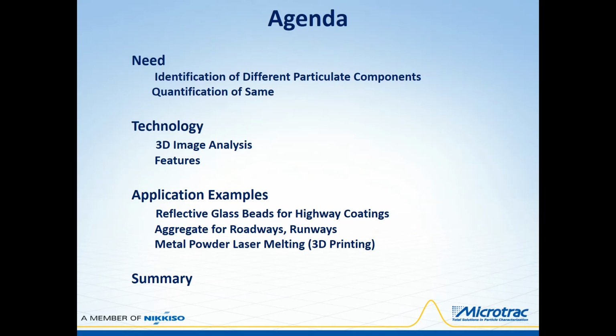In today's presentation, we'll cover the ability to isolate different particulate components in one sample by first identifying them and then quantifying them. Then we'll review 3D image analysis technology and go over its important advantages over 2D technology.